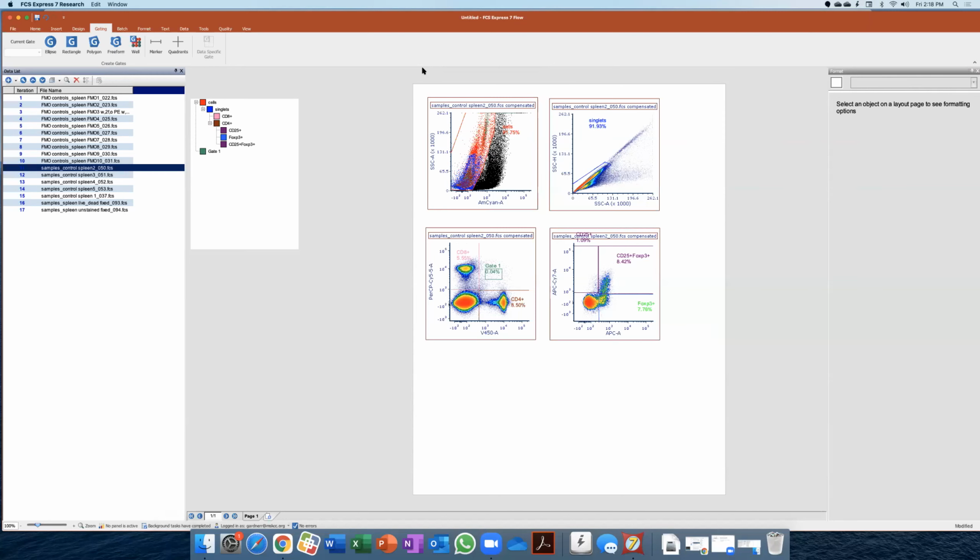That's a very different comparison that you're trying to do. If you're trying to say this percentage of my population is GFP PE double positive on day 1 versus day 10, just the biological control should be sufficient. If you're trying to say I have an MFI of 50,000 on day 1 and 20,000 on day 4, and there's this X-fold difference, you need to run standardization beads to make sure that the instrument is the same from day to day, or we're accounting for changes.